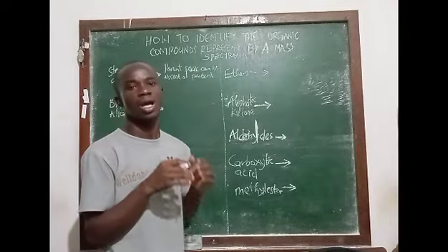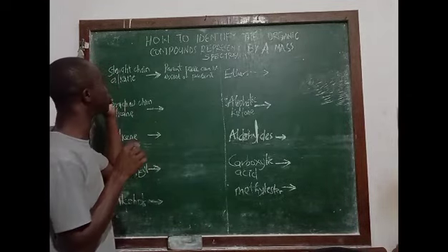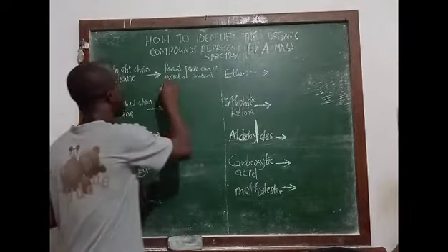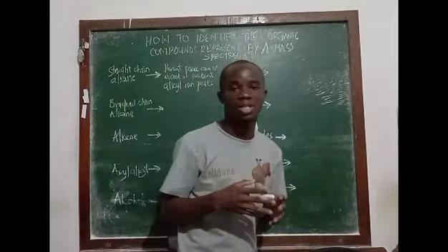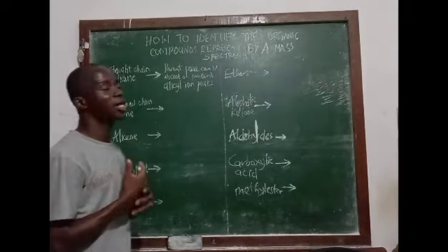That's what that implies. Another thing that's particular for a mass spectrum that represents a straight chain alkane is that you can always see alkyl ion peaks in the mass spectrum. What do I mean by alkyl ion peak?